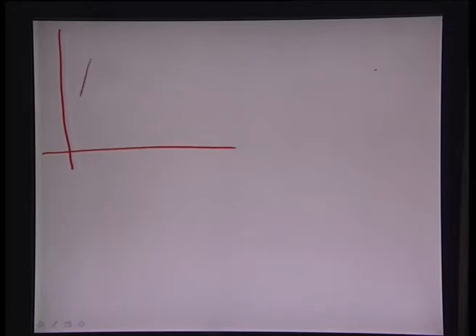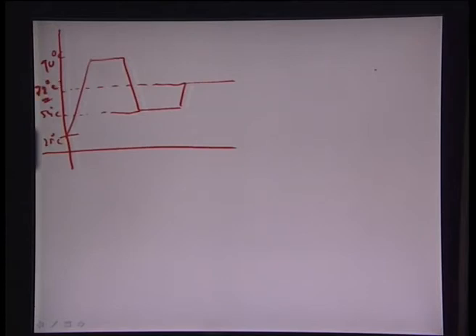Here you go from, let us say, about 25 degrees Celsius all the way to about 90 degrees Celsius, stay here for a little bit, go down to about 54 degrees Celsius, stay here for a little bit, and then again go up all the way to about 72 degrees Celsius.